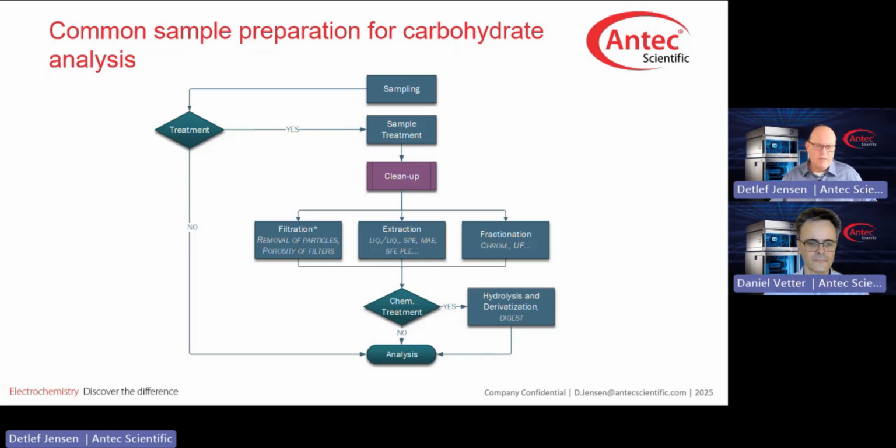For example, if you get a sample in after sampling, you have to decide whether you want to do sample preparation, yes or no. But don't get fooled. Even if you say no, I don't do sample preparation, there is a price to pay. Why do we do sample preparation? We do it to simplify the matrix, to get improved analytical data, and to protect the consumables, the columns for example, so as not to exchange them too often.